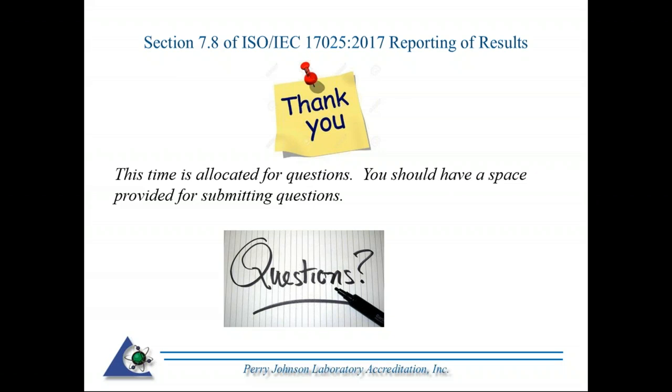I would say, if you're going 2 years without having it calibrated, a good check standard or working standard may be a good idea as an intermediate check. Or perhaps you could have two of them and intercompare the two. It just depends on how critical that is to your testing results. Do you calibrate the internal reference barometer? That's not really needed unless you feel it's drifting. If you're comparing a standard to an unknown, and you're just looking at the differences there and looking for drift, then no, for the check standard, I would say you don't necessarily have to have that calibrated.